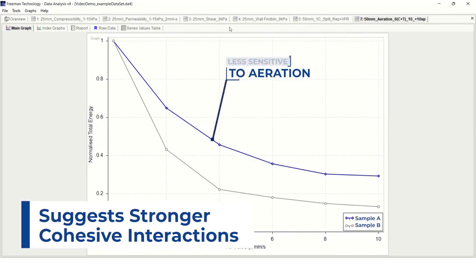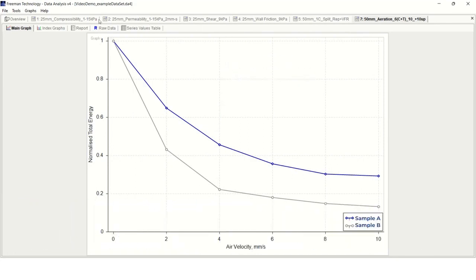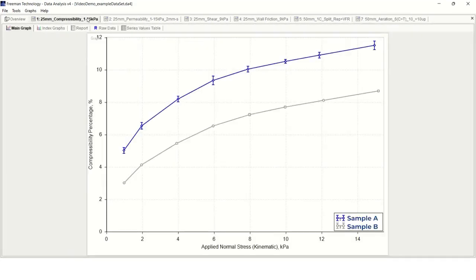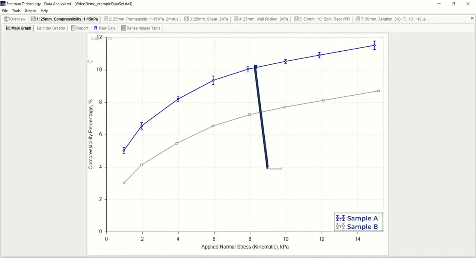We can also look at the bulk properties to compare these two powders in terms of their compressibilities, as shown here. We can see here that sample A was more compressible. These results, along with its decreased CBD, further indicate that this material has less efficient particle packing structure.